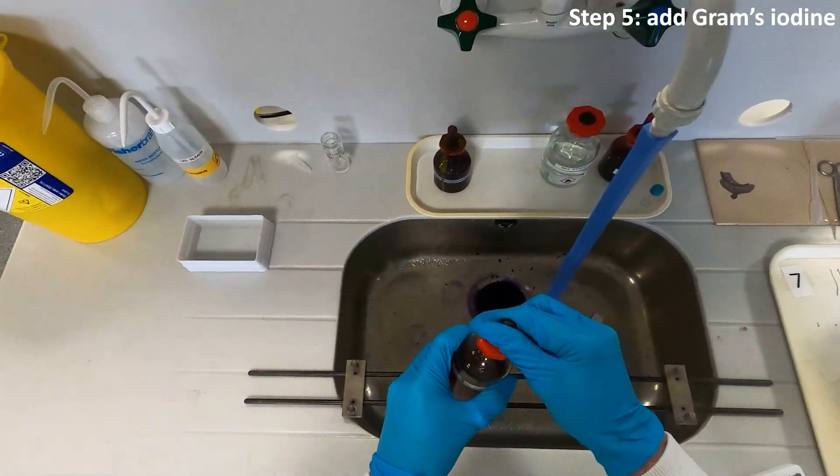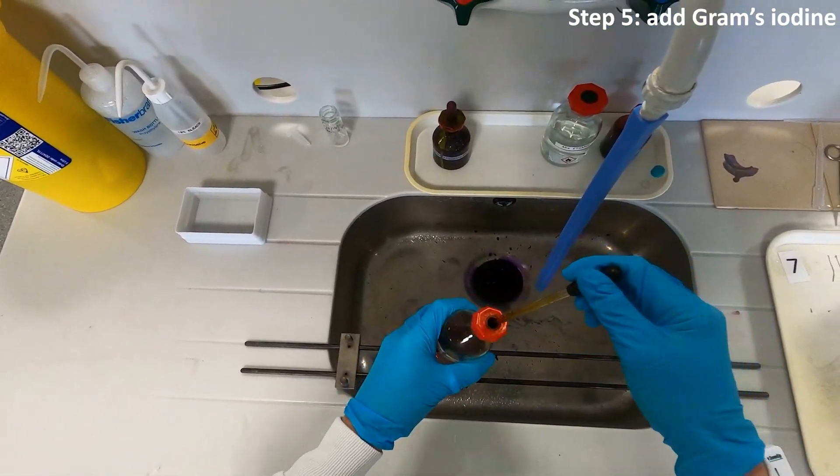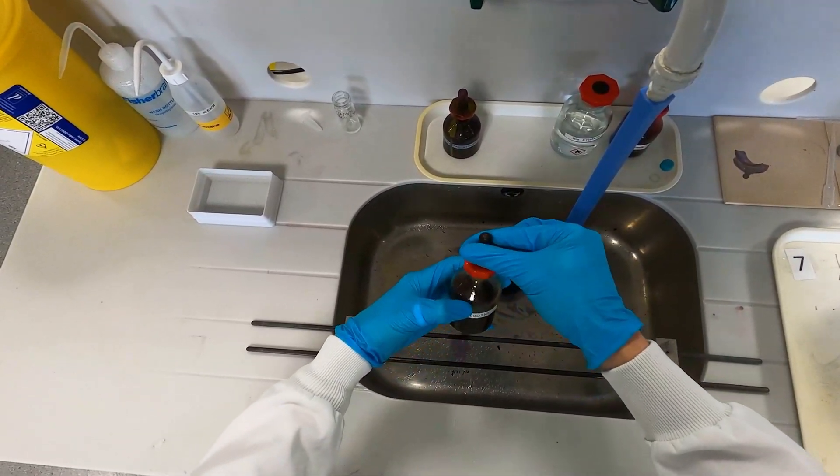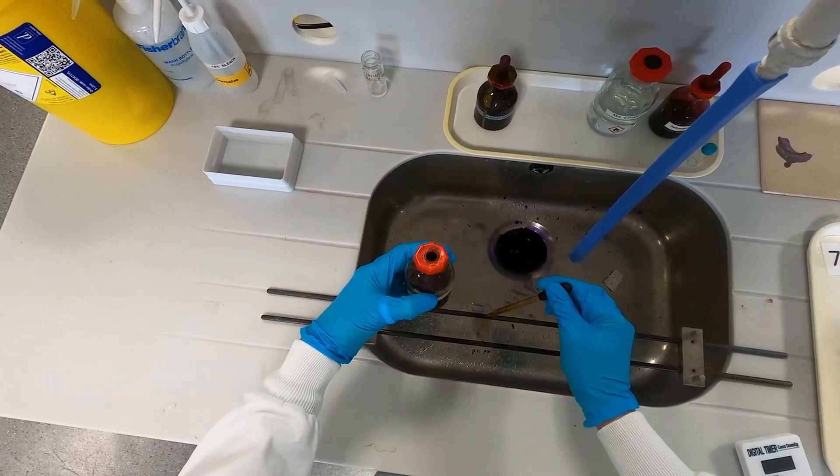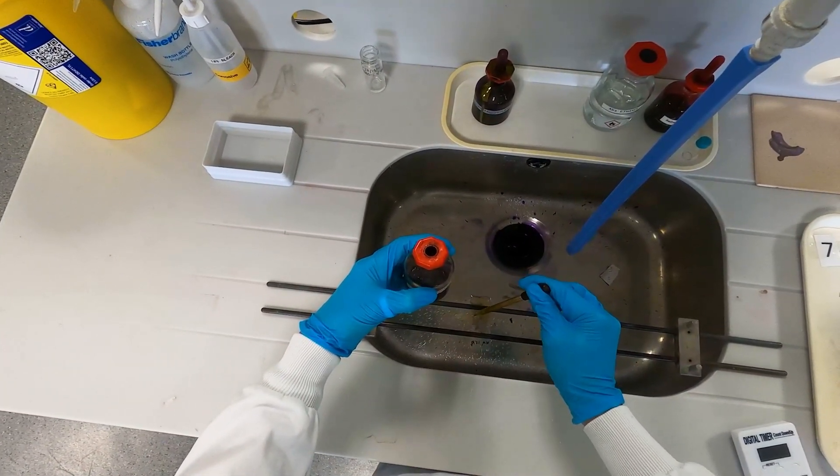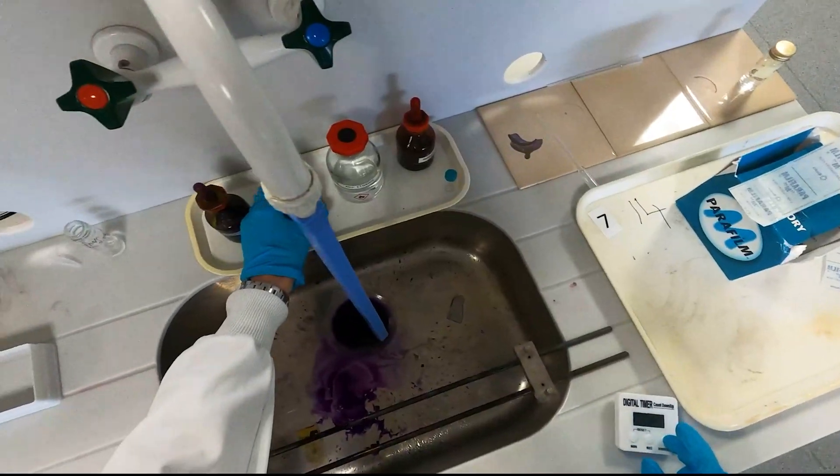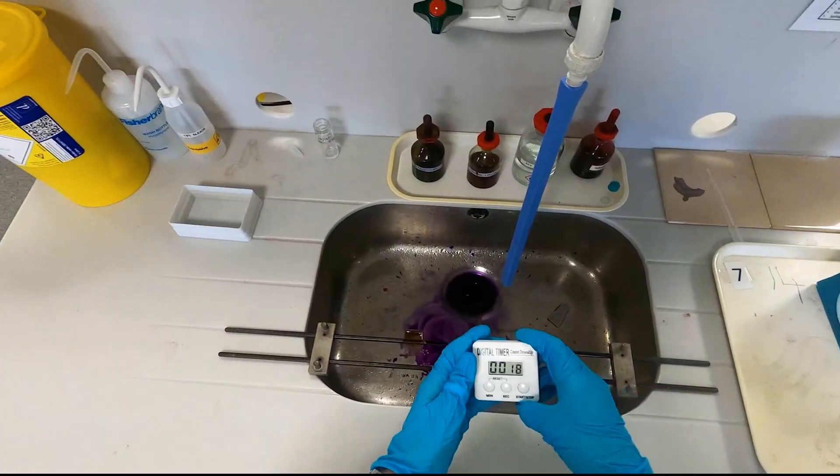Next add a few drops of Gram's iodine. This is your mordant, which binds to the crystal violet molecules and traps them within the cells. Wait another 30 seconds and then rinse under running water to get rid of any excess iodine that still remains.